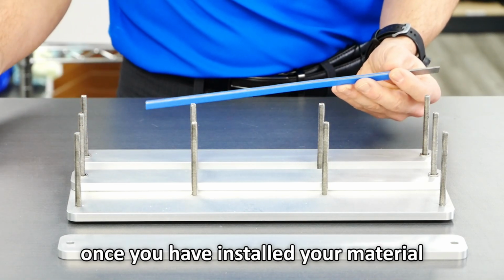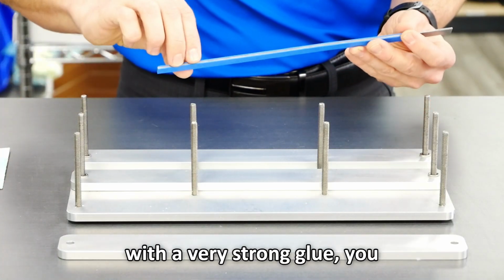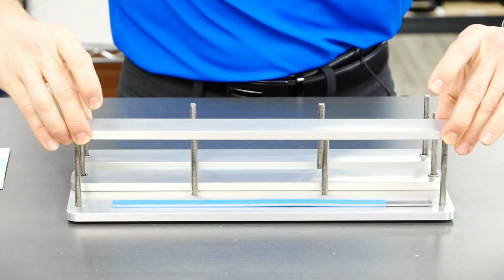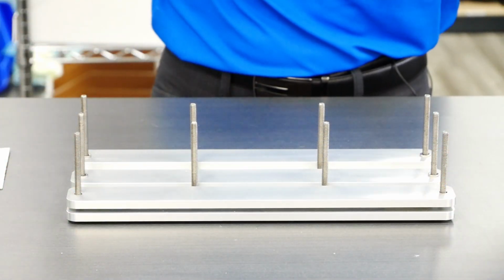So once you have installed your material with a very strong glue, you can install it on your preparation tool like this. Install the washer.